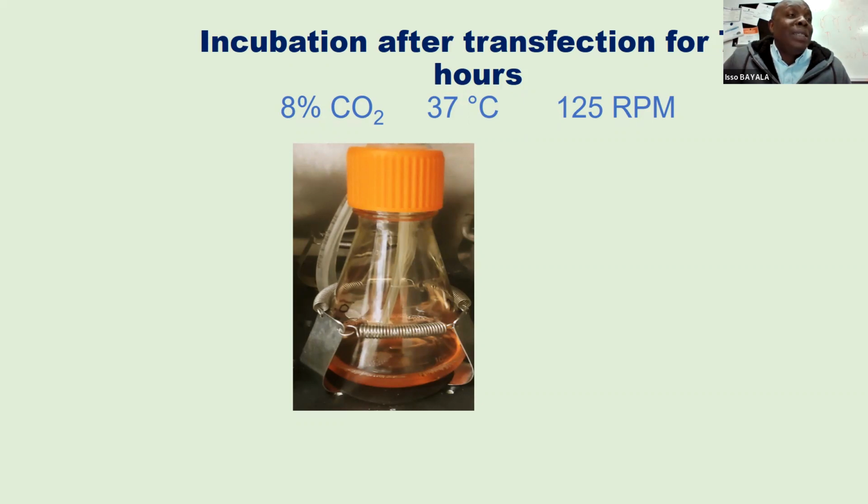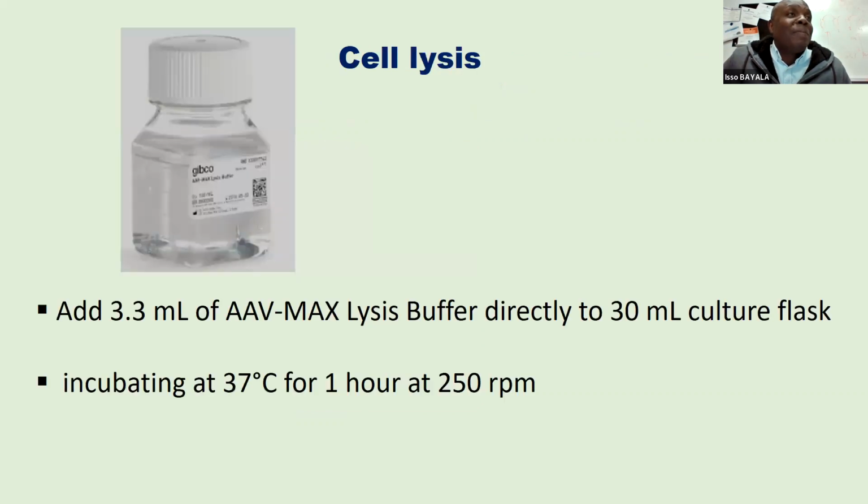After the 72 hours, we can directly add the lysis buffer into the cell culture, lyse the cells, and wait 1 hour. Then we continue with harvest and centrifugation.